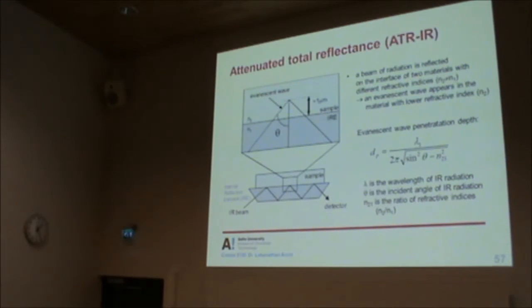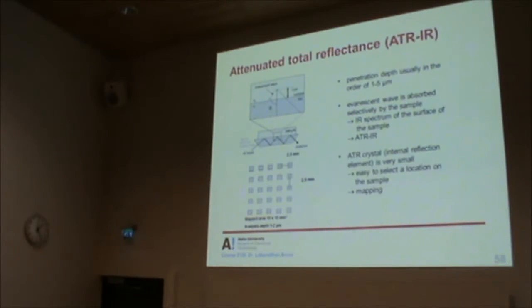Now, if we are sending infrared radiation of specific wavelengths, and if there are bonds that can absorb infrared radiation, the intensity of the light that is getting reflected will decrease, will get attenuated. Based on how much absorption is happening, you can tell whether the molecules are there or not. And one more level of knowledge to this setup.